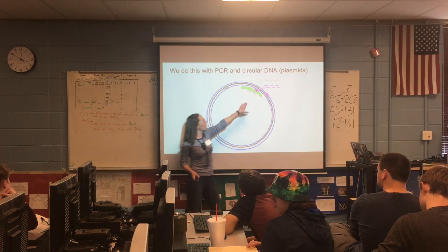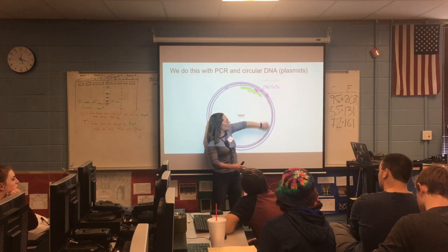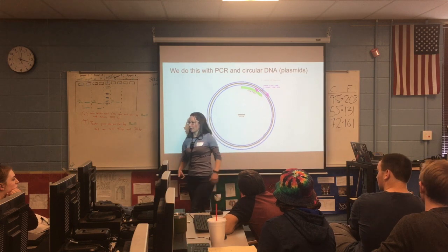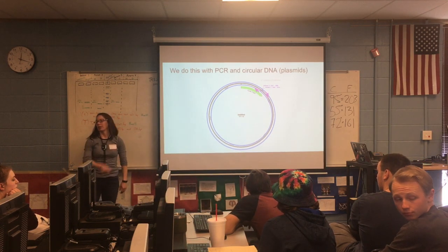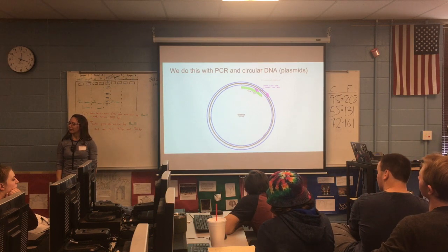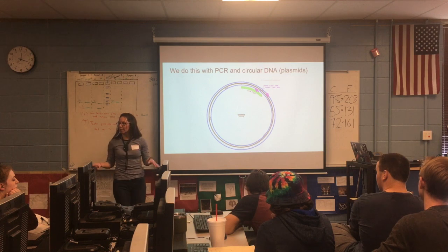So this is basically what we did last time, is we just had a primer here and a primer here, and we were only copying off a piece of that plasmid. This time we're going to copy the whole plasmid. It's just really hard to make that into a visual activity for anybody to do. So that's why you guys broke it. That kind of makes sense?